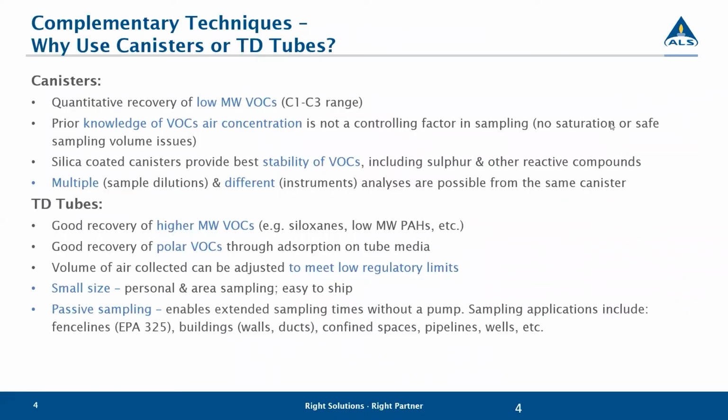So when you're looking at canisters, and we often talk about why is one better than the other, what we do with the canisters is we get a stable sample. But keep in mind the reporting limits that we're giving you on your report. If we don't have to do a dilution on your sample, so there's no comment as far as increased reporting limits, we have actually diluted the sample with nitrogen if it's for VOCs and sulfurs, with helium if it's for fixed gases.